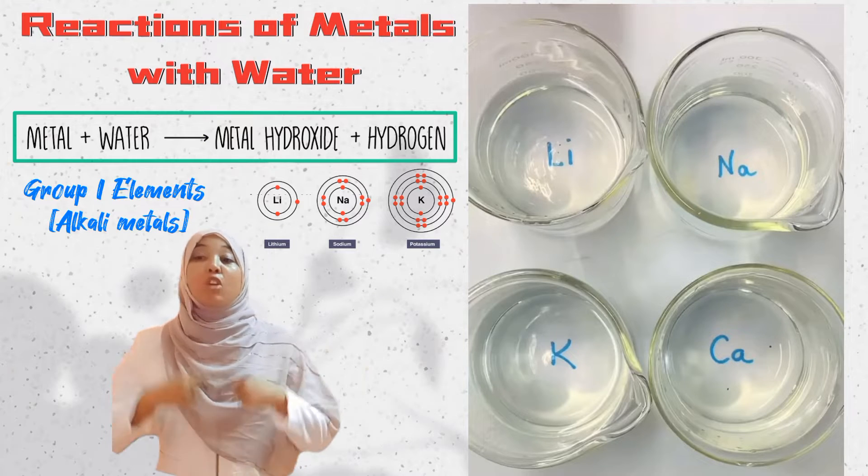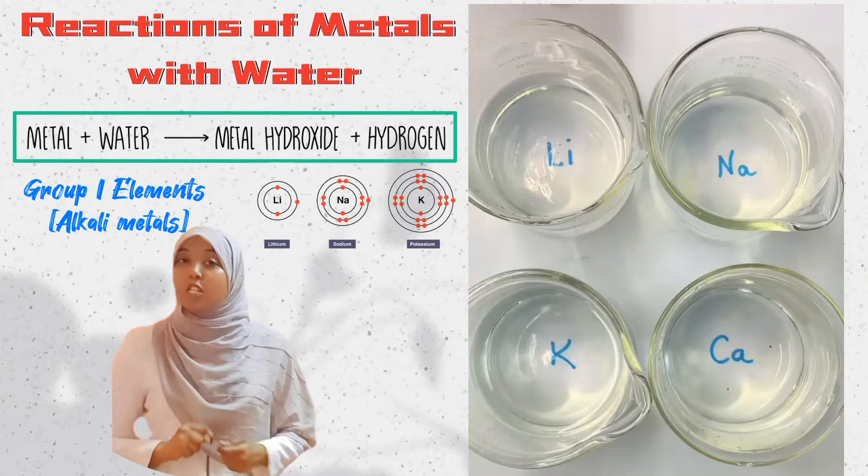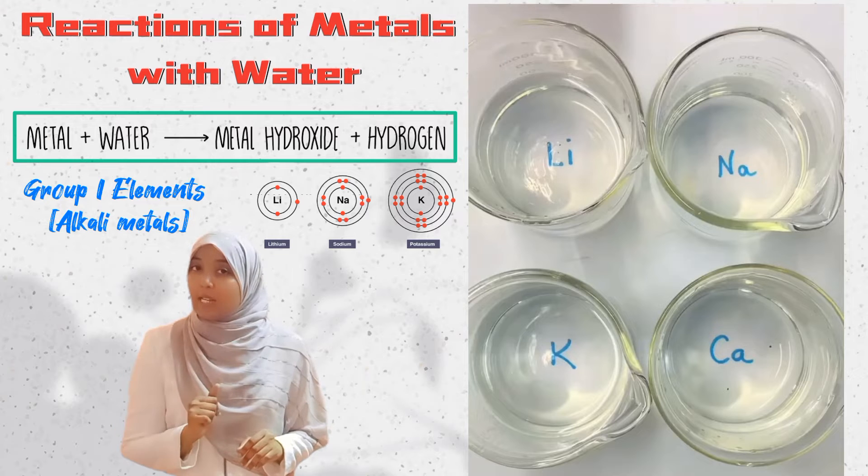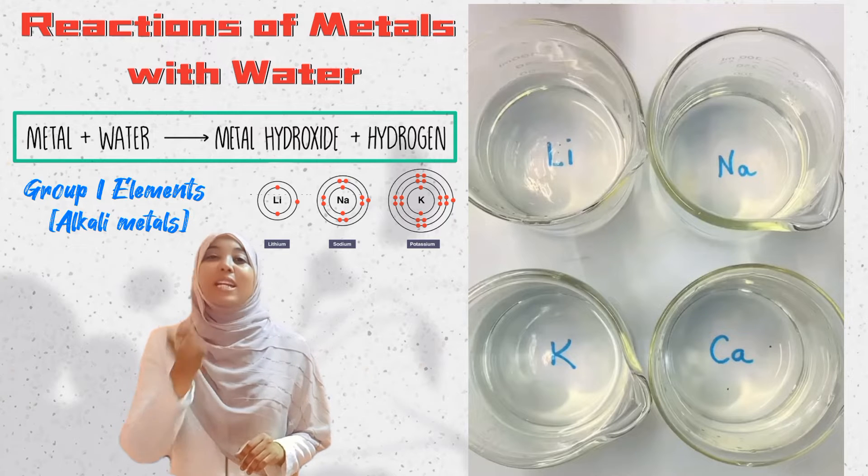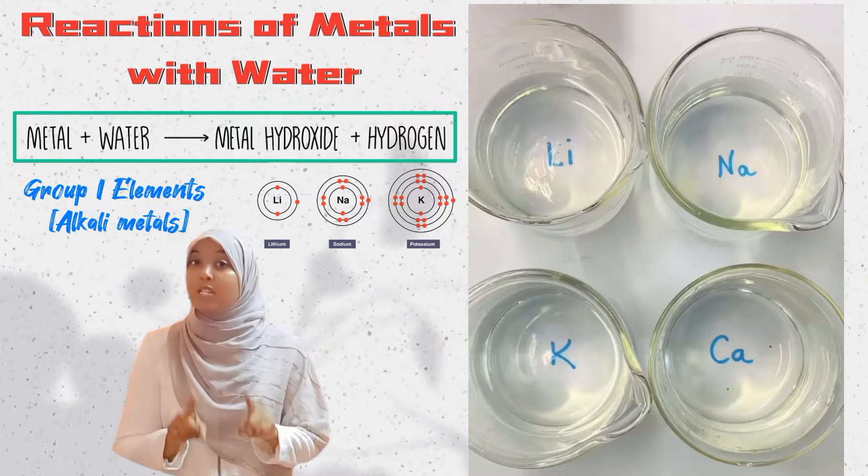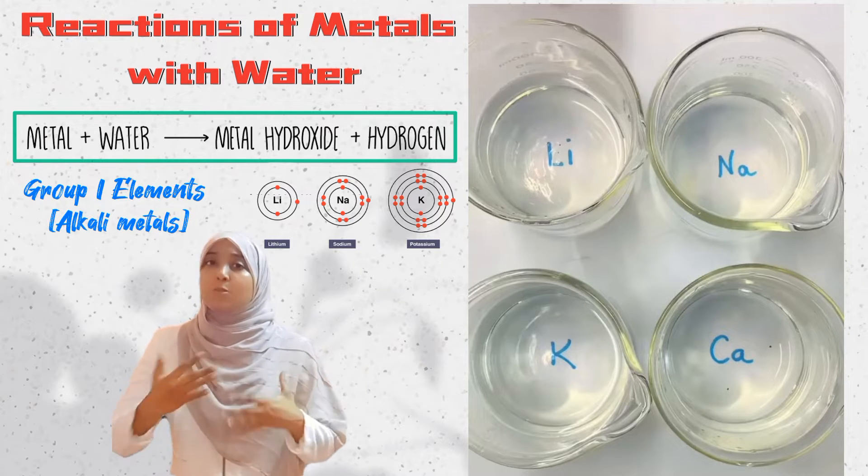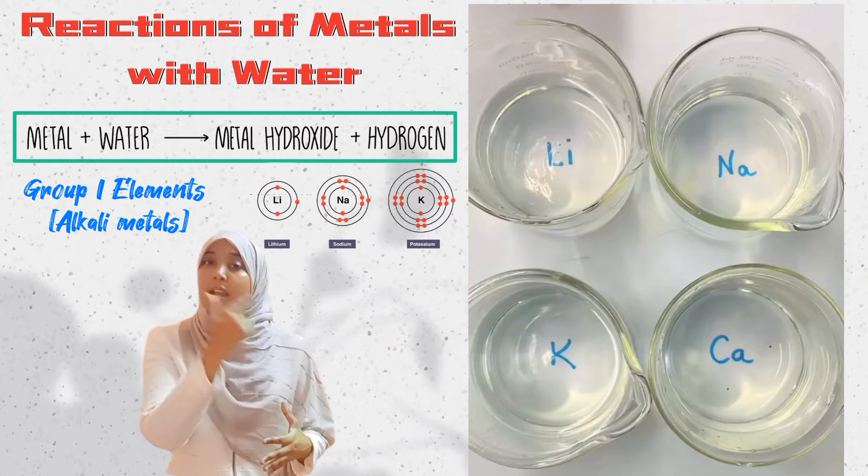All these beakers contain water with an indicator that has been added. If the solution turns blue, that means the solution present within the beaker—or the solution formed from the reaction of the metal and water—is basic.